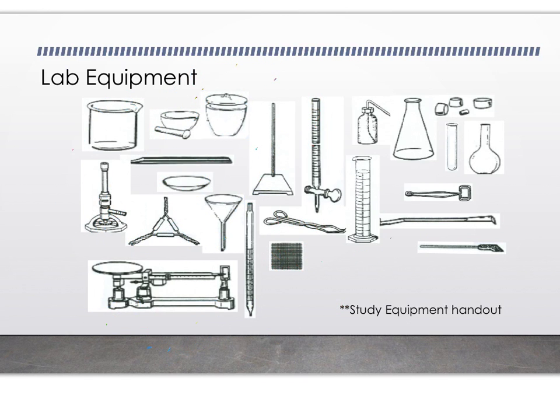Okay, so I just erased all the other words so I can have a little bit more room to write. But going on to the next picture, this is a wash bottle. And this is used to dispense different amounts of your water, normally used to wash off your equipment, or even add a little bit more water to your reaction.